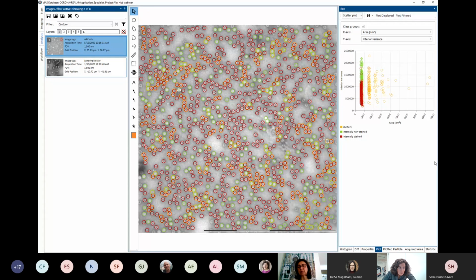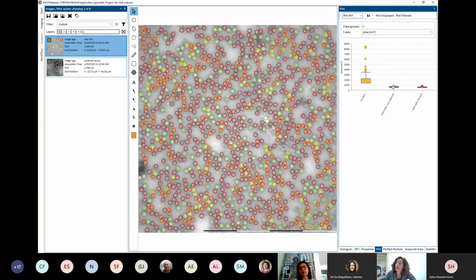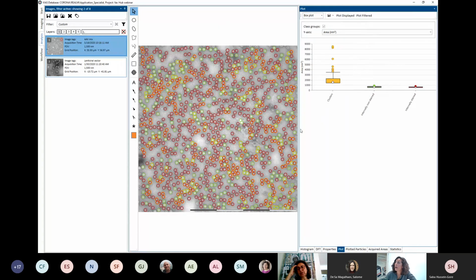The one which is the particle size distribution, where it looks pretty straightforward, but if you look at it closely, at least on one side, on the right-hand side, it has a potential second hidden peak. Not this one, the one which you showed much earlier on.